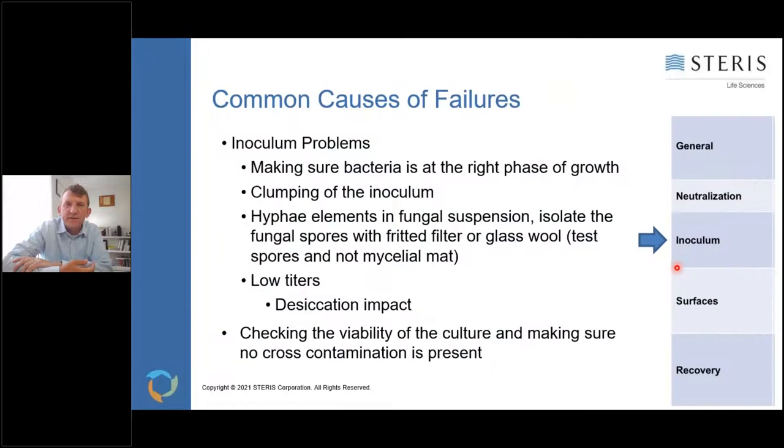Next slide, please. So the next common cause of failure is issues with the inoculum. And this is something that we continue to learn about. During some of the work with the AOAC sporicidal method, there were a lot of evaluations into inoculum preparation and what impact the media has on the susceptibility of the spores.